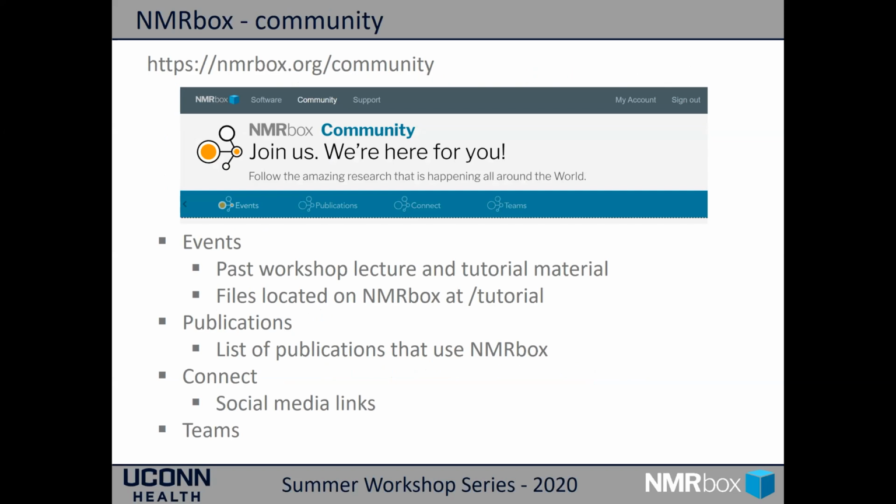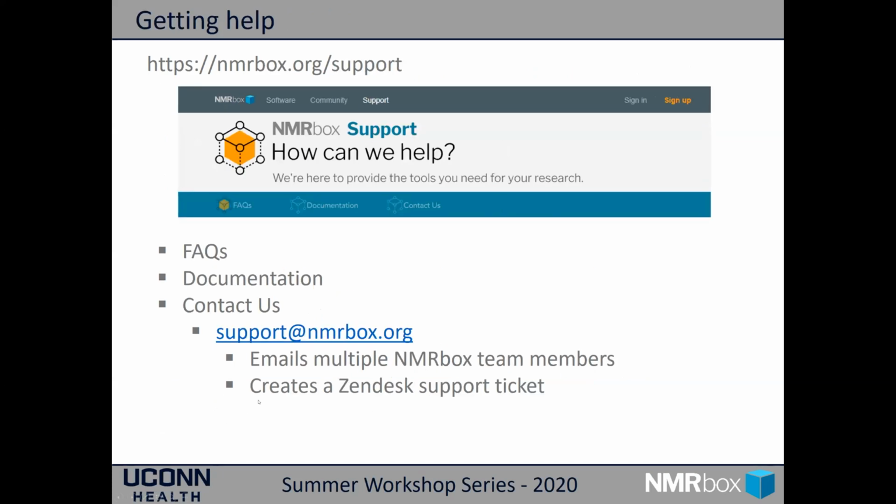So the NMRbox community website has our events, our publications, how to connect to us, our various teams. There's a support page on our website with FAQs. I do ask people to go to the FAQs very often. We get a lot of support tickets with over 2,000 users, and the majority of our support tickets now are just a matter of pointing somebody to our FAQ page where the answer already lies. There's also information about how to contact us.